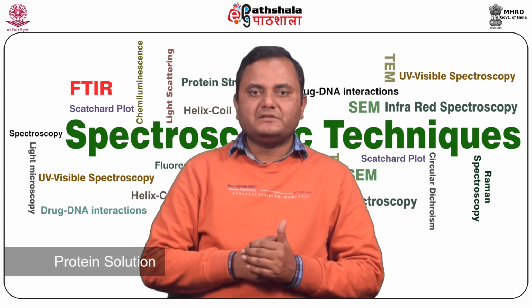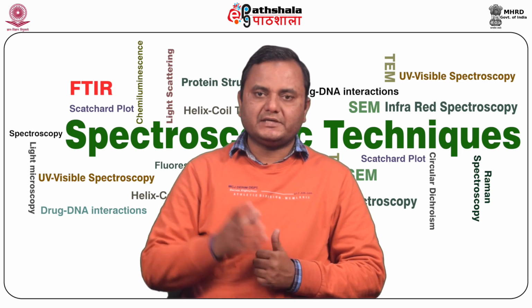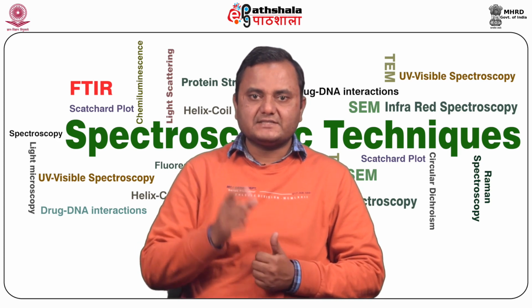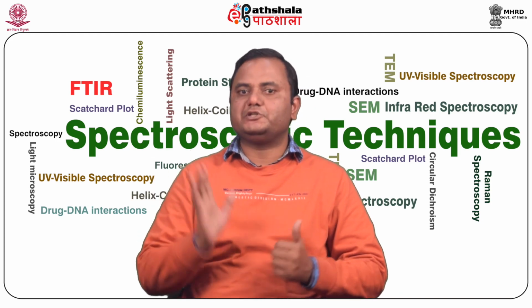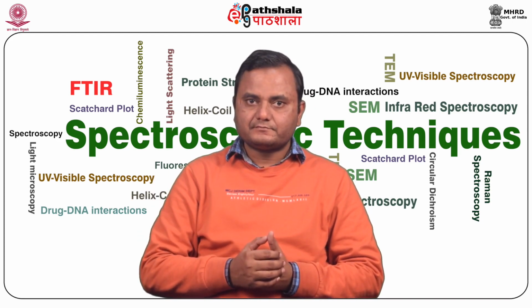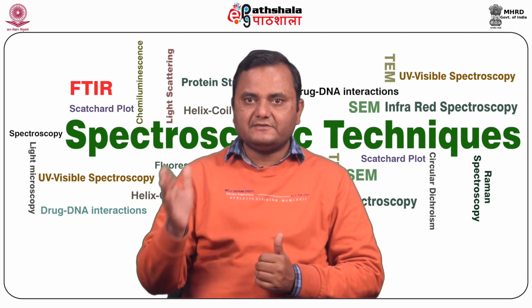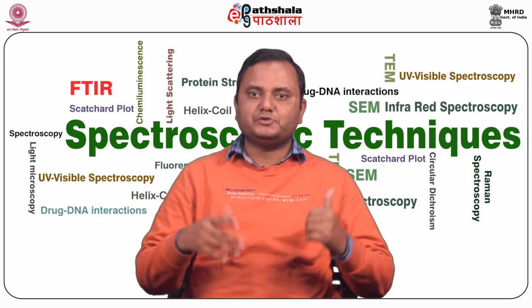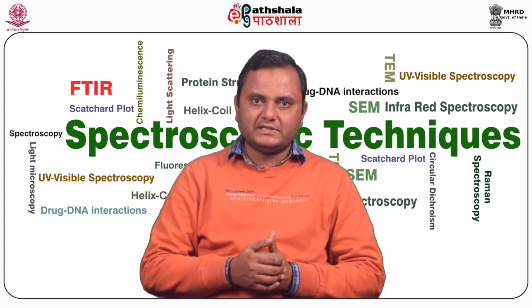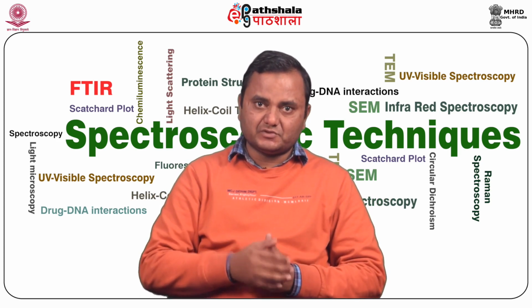About the protein solution, it follows from the above that the protein solution should contain only chemicals which are necessary to maintain its structure and stability, at the lowest concentration possible. You must avoid any chemical that is unnecessary for protein stability and solubility. The protein itself should be as pure as possible, and additional protein or polypeptide will also contribute to the signal, so it should be avoided.